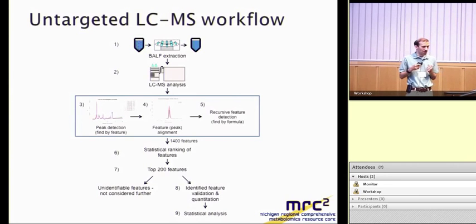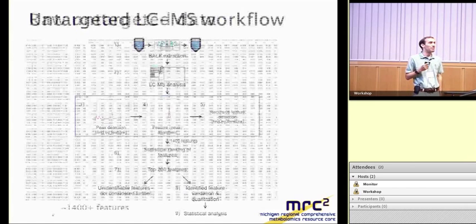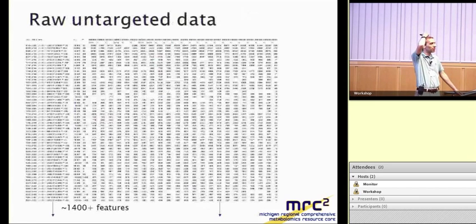So just because a method can be applied to targeted metabolomics doesn't limit you to using it that way. Oftentimes, if you run it on an appropriate full scan mass spectrometer instrument, you can do either targeted or untargeted metabolomics on effectively the same data. So we used that HILIC method that I already showed you, except we did the data analysis according to an untargeted workflow. And so, okay, all of that's done, right? We'll jump to that step.